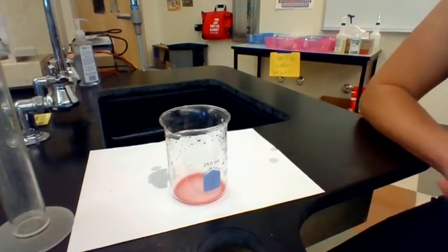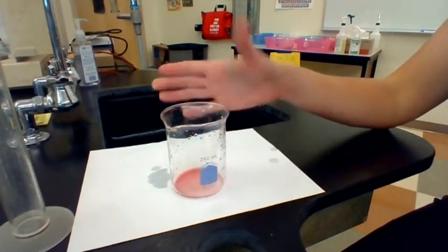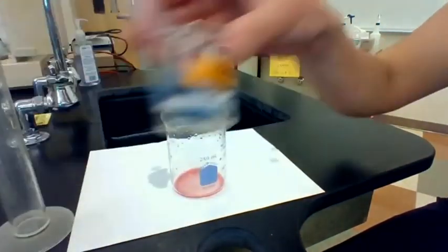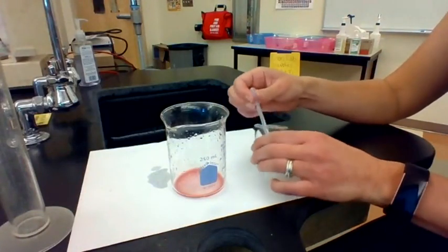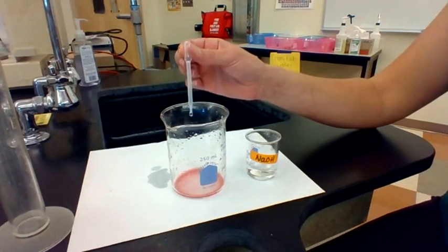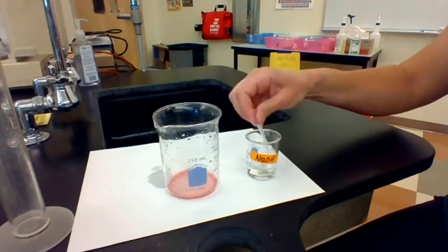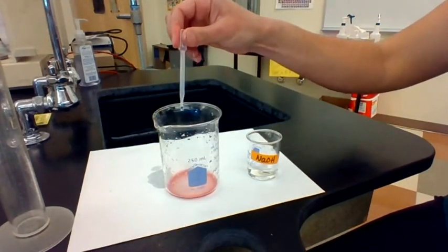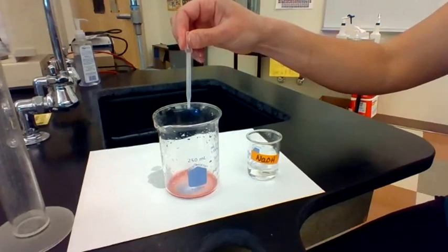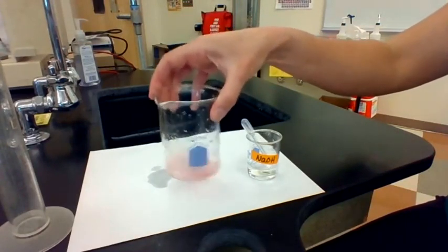Okay, so now what we're going to do is the same experiment. So I started again with about 6 drops of HCl, and I added a bunch of indicator. And this time, instead of adding water, I'm going to try adding some sodium hydroxide. So I'm going to add sodium hydroxide, 1, 2, 3, 4. And I'm going to swirl along the way. Let's see, 5, 6, 7, 8, 10. And I'll figure out how many drops of sodium hydroxide it takes to neutralize it.